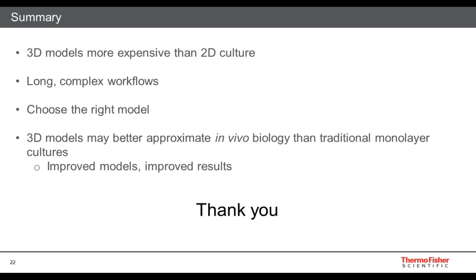Really, it's just a way of trying to identify as early as possible in your protocol whether or not things are progressing in the manner that you want them to, so that you either continue to culture, or if you look at your gene expression and find what you feel is an unacceptable level of off-target differentiation into cell types that are not important for your model, then you've probably reached a decision point where you can stop and start over and try again.